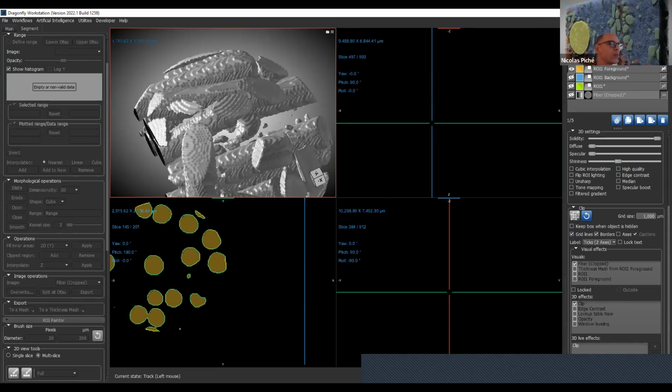Well, it's now the time to introduce watershed. Watershed is a classical algorithm to disambiguate objects that are touching. It's not perfect. Sometimes it's difficult when you have objects of very different sizes and their convexity or concavity is very pronounced, and peanut-shaped objects and all that are difficult. But for such a well-behaved dataset, it's not so tough, and I will show you how to do it.